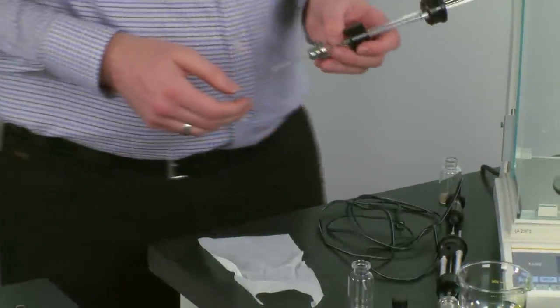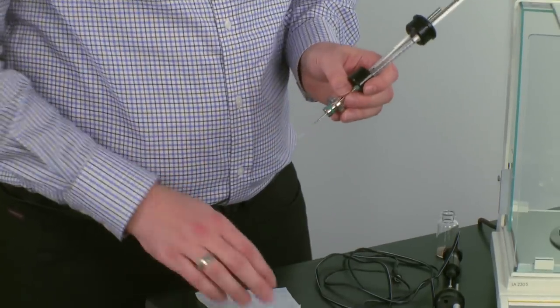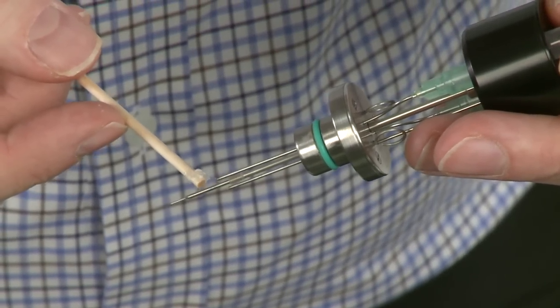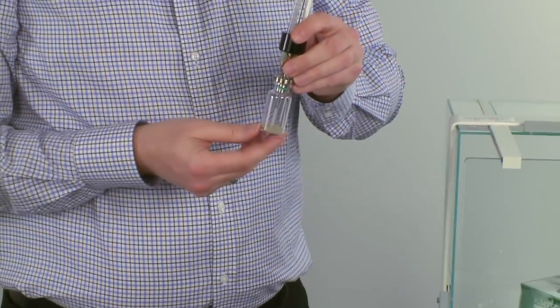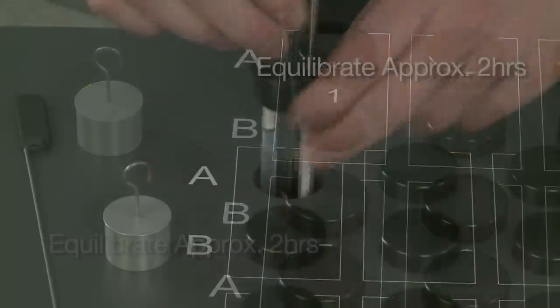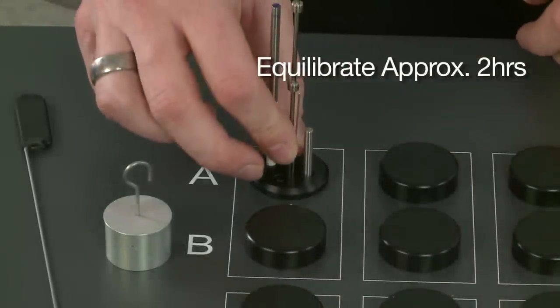The last preparation step is to seal the open cannula with grease. Then mount your prepared cement sample and put both inside the Tamair.